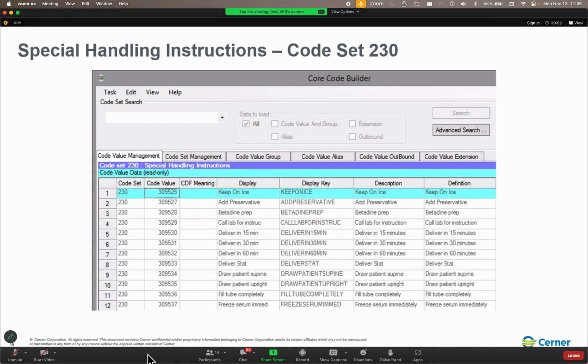Now, when you're adding this in, you're going to want to put an identifier on here. And folks, this can be your DL number username. This can just be your number. This can be your initials, whatever you want to do, but just make sure that you identify your build consistently. So all of the build that you do in class should have the same identifier on it.